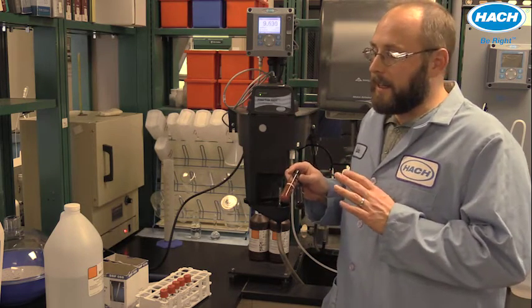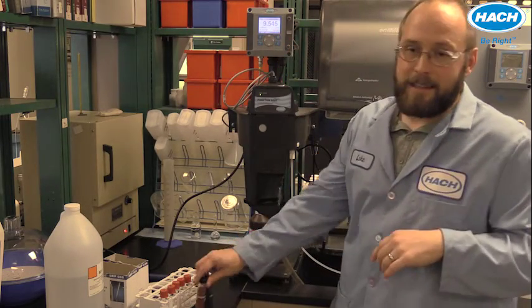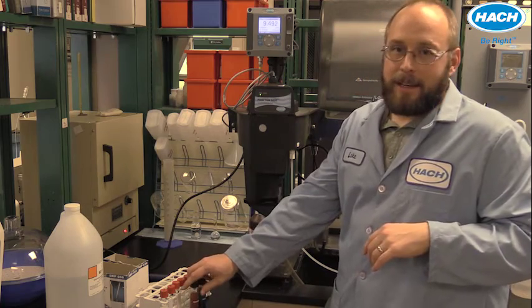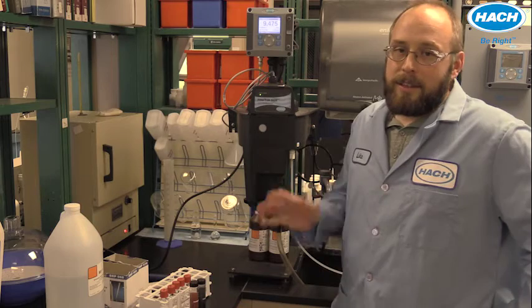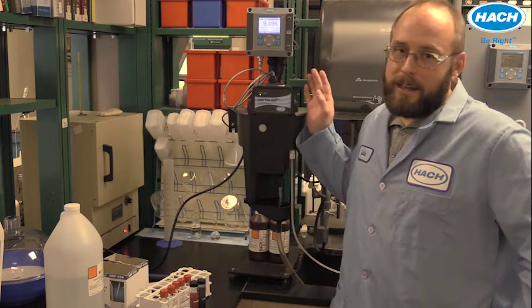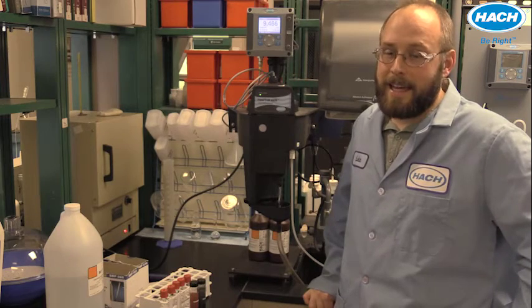What that means is that in order to make this number, which reads out in milli-NTUs, mean something for an iron concentration, you'll need to do a calibration of that number with the lab total iron test.